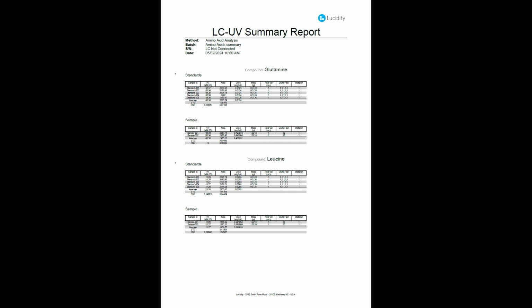The report calculates the average for retention time and area, the standard deviation for each, and also the percent RSD for each. The concentration for the standard is manually entered when creating the report, but the concentration of the sample is calculated from the standard concentration, the standard area, and the sample area. Again, this is just an example of this report, and this report can be customized to fit your institution's needs.